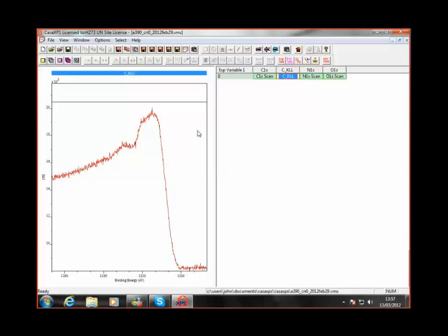There's not much information about this in the XPS spectra. You could have a look at the carbon 1s peak, you can have a look at the valence band, and there's a whole set of literature about both of those. But for simplicity's sake, one of the most commonly used methods is to look at the X-ray induced Auger peak, or feature in the XPS spectrum, which you can see in front of you here.